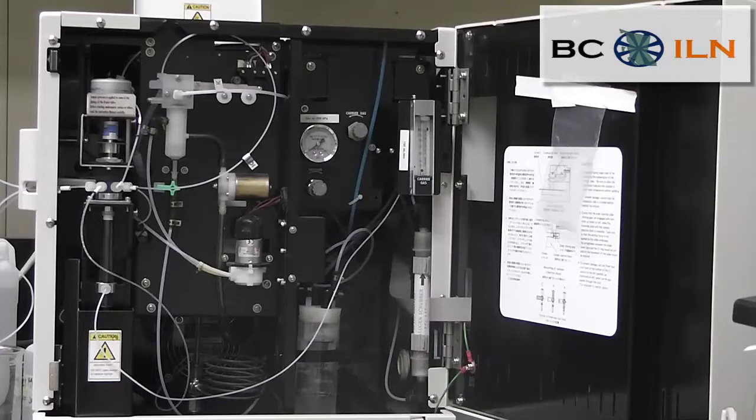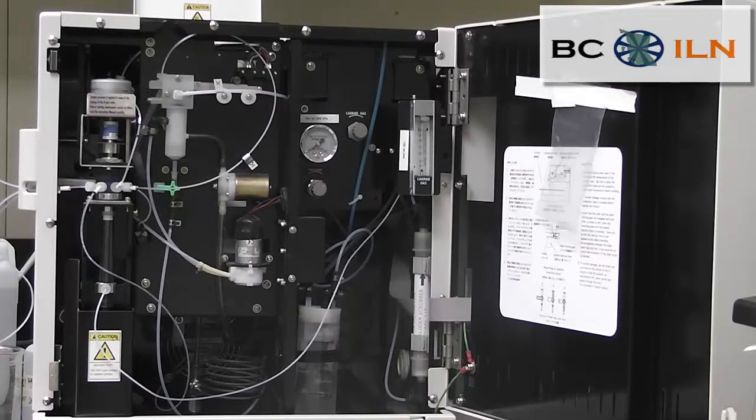So this is what the inside of the instrument actually looks like. It looks quite complicated, but how the instrument actually works and how the samples move through and what is detected is not very complicated. I will be explaining to you the step-by-step process today.